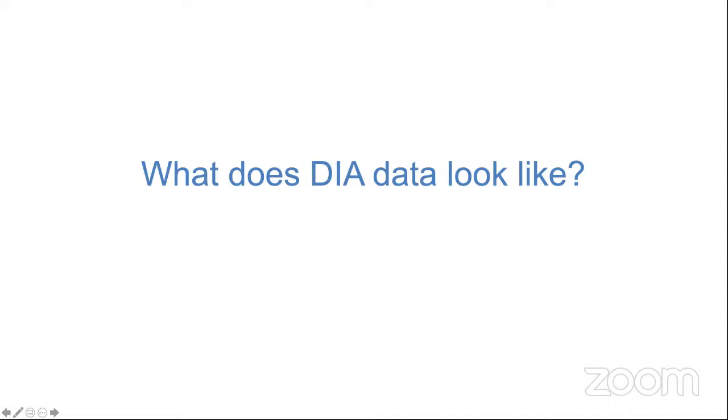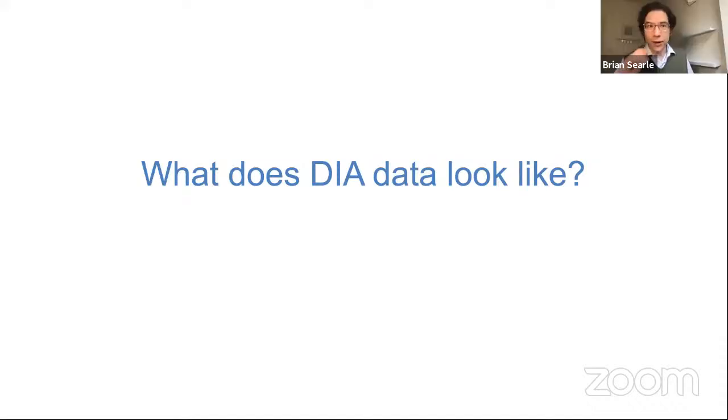Sorry, there was one more question, Brian, that I thought was really good. I think you're going to get to it later, but what do you think about isolation windows overlapping, having more peptide identifications? So overlapping DIA windows, more identifications? Yes, no? We're definitely going to talk about overlapping windows later on. That's a fantastic question. We'll get there, definitely.